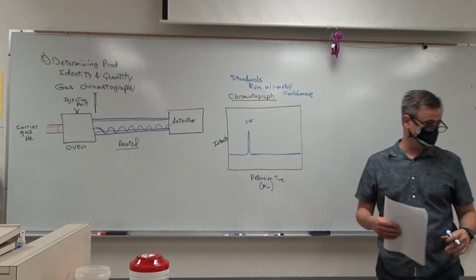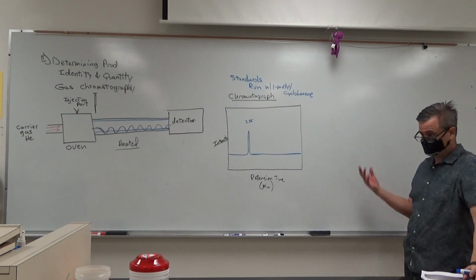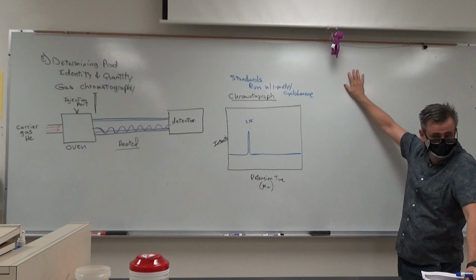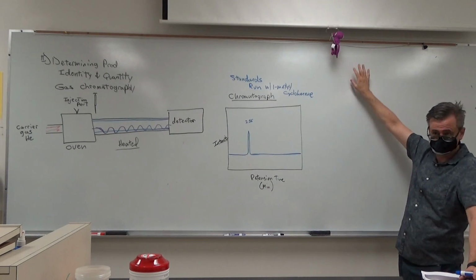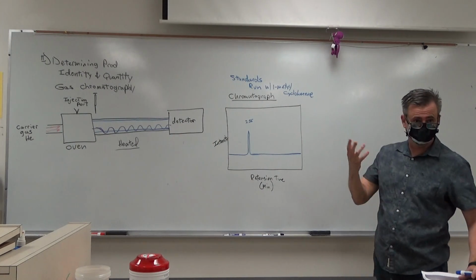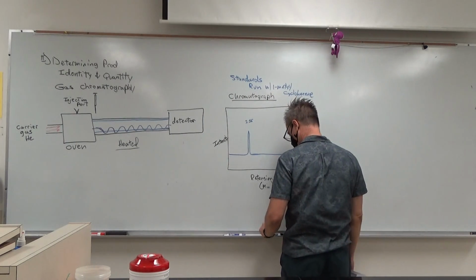That part is done when you guys aren't at the machine. Okay? We have purchased these standards. Okay, 1-methyl, 3-methyl, 4-methyl cyclohexenes, the alkene isomers, all that stuff. Yeah. You shoot it in so that you know what's going in there, and then you record the retention time. Okay?